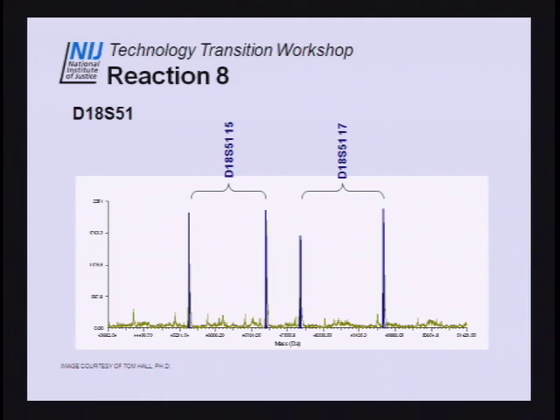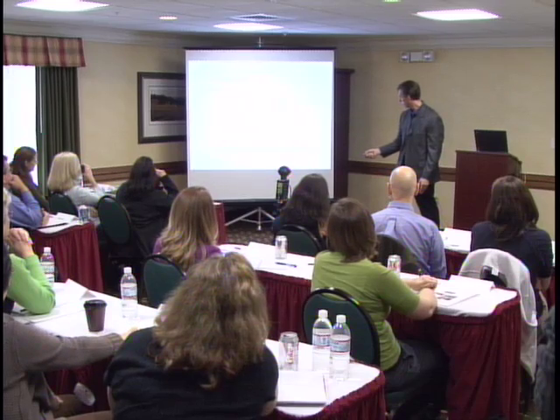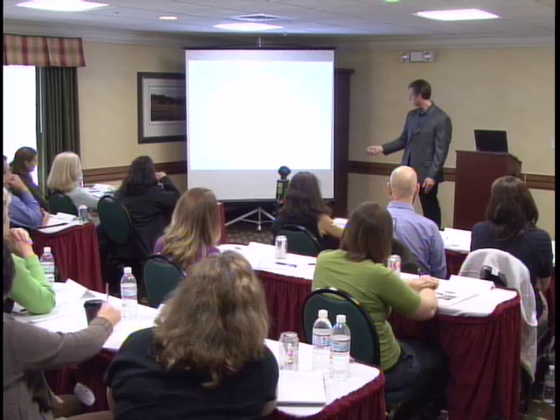Did you see any stutter peaks? We have seen stutter peaks, yeah. In fact, there, I think we're probably seeing a stutter from, I'd have to look at the masses on that. Here, and then here, probably stutter from 2 different products. It depends on the locus, just like for traditional typing, but yeah, you'll see stutter.